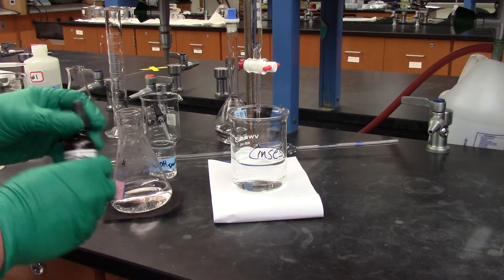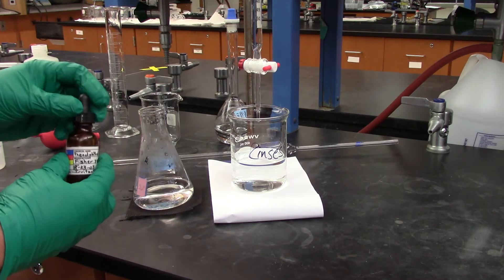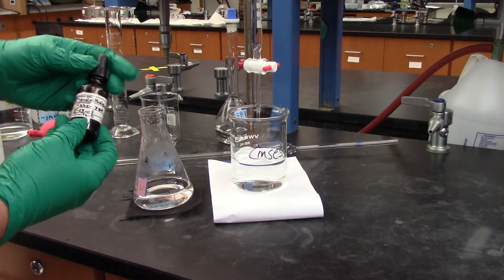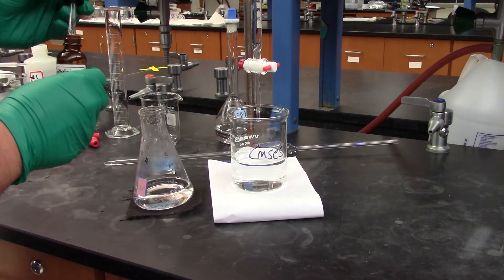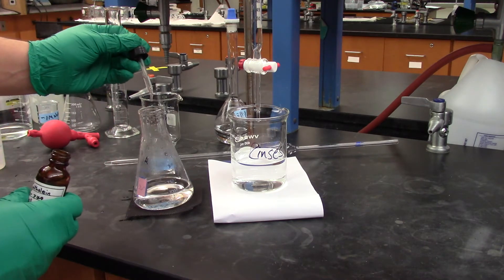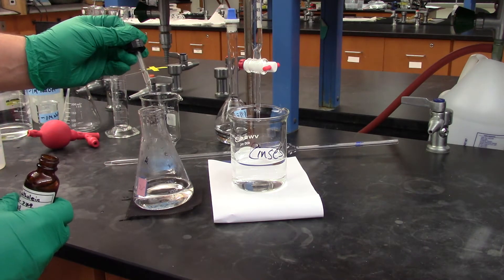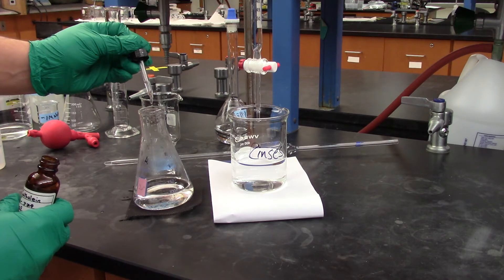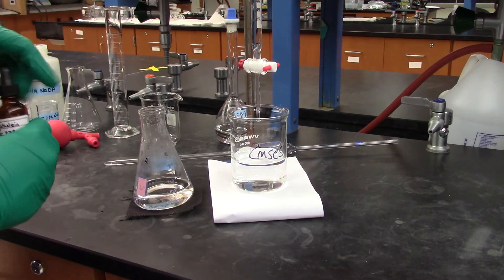Before we do this, you want to make sure the point of this is we have to put in our indicator, which is phenolphthalein, and the directions say three to five drops. So make sure to do that. Two, three, four, five. It's probably six, but that's fine.